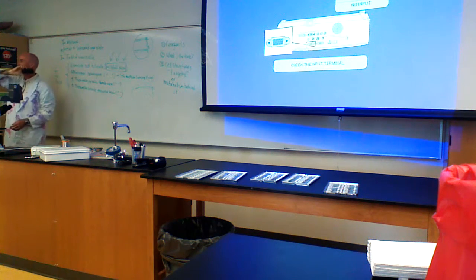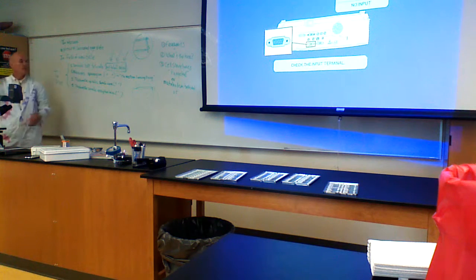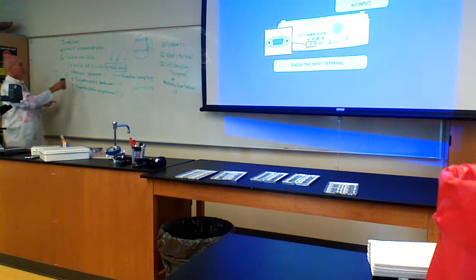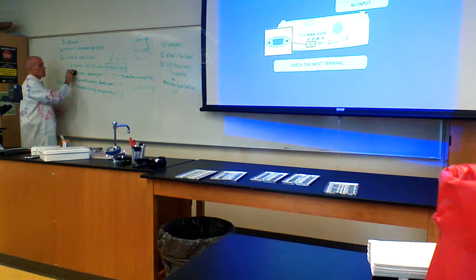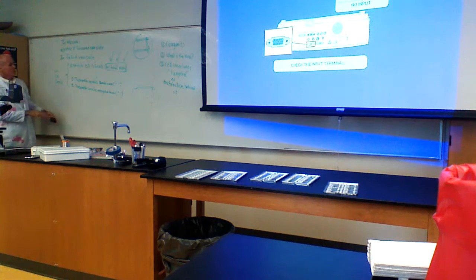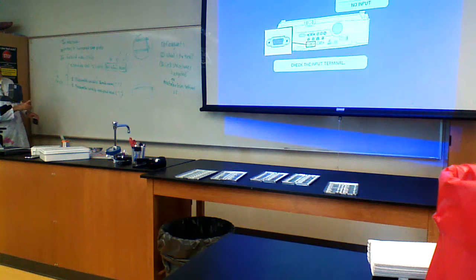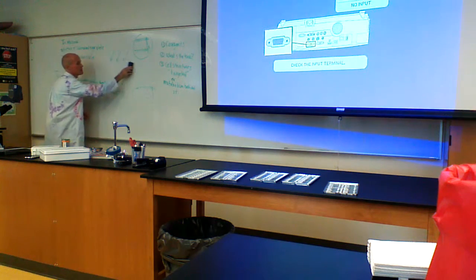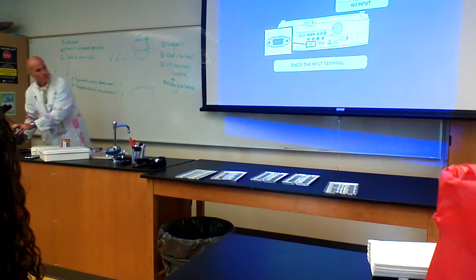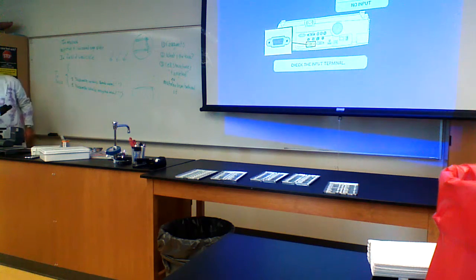Okay, so your Sabouraud plates are still there. I want a picture of the Sabouraud agar plate now, and I have a reason for this. Just put it in your notebook. For today. Okay. What else do you have to do? Let's take out this one. Okay. So I want two drawings in the notebook. The reason I want this is as follows.